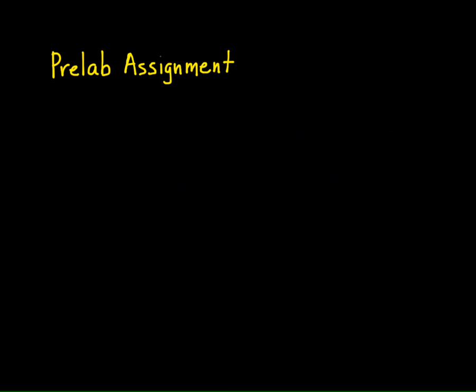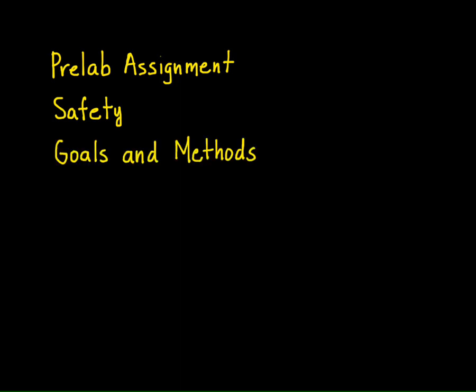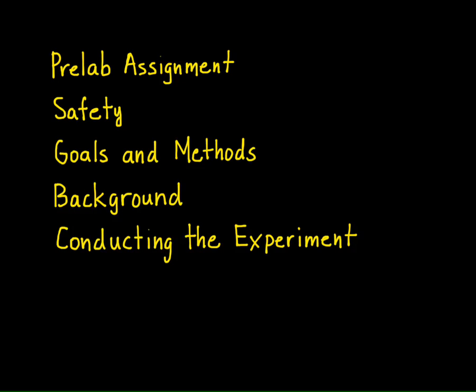In this video, we will cover the pre-lab assignment, safety information, the goals and the methods used to achieve those goals, information about the different classifications of alcohols and their ability to form carbocations, some specific information about conducting the experiment, how to clean up, and finally some tips on the PostLab analysis.